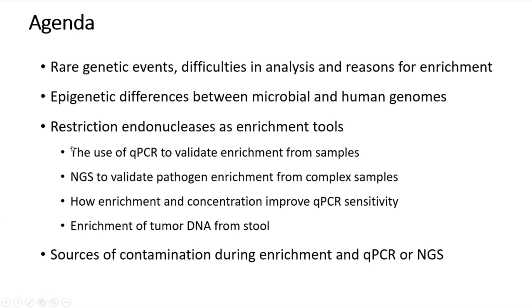One of our favorite enrichment approaches is actually epigenetic, and I'll talk to you about what kind of epigenetic differences there are in microbial versus human genomes, and even within the human genome, that make this such a powerful tool. Probably one of our favorite enrichment tools are in fact restriction endonucleases, which is a relatively novel approach, and so I'll walk you through how we do that and some of the validation tools that we've used to show the power of this approach, notably qPCR, some NGS that we've done in order to look at how enrichment occurs in more complex and real-world samples. And then ultimately, the use of enrichment also provides concentration that really improves sensitivity. That's one of the main difficulties when working with rare genetic events.